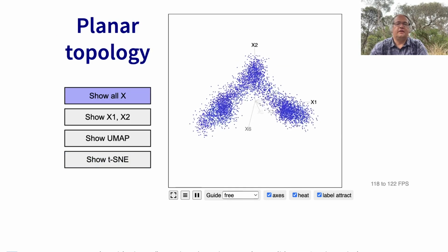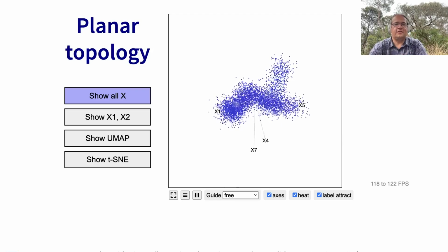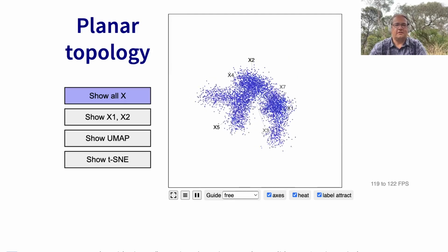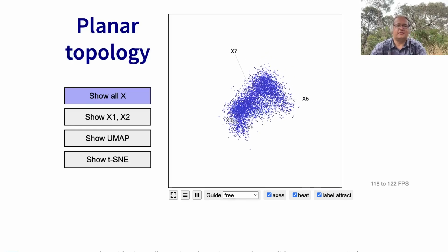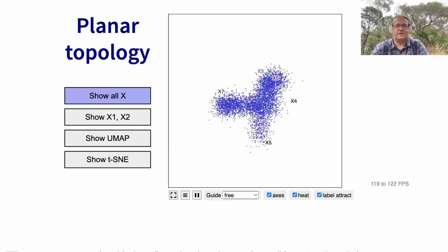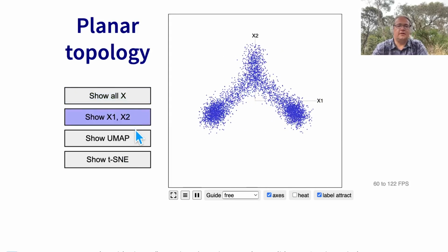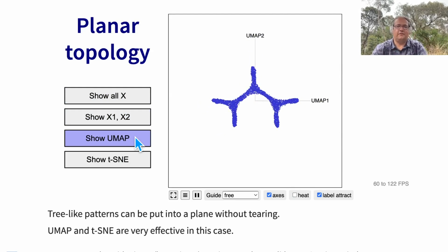But finally, here is a complex high-dimensional object, but as it happens, it is something that we can represent in 2 dimensions and preserve the topology of the data. So we could look at this spinning randomly in high dimensions, and you'll eventually make some sort of sense of it. But if we look at the UMAP, it provides a really nice map of the topology of the data. And so this is a good reason for using UMAP.